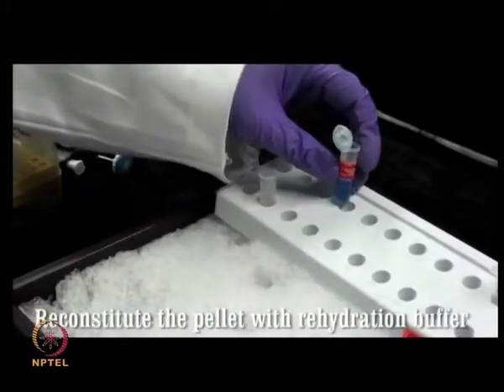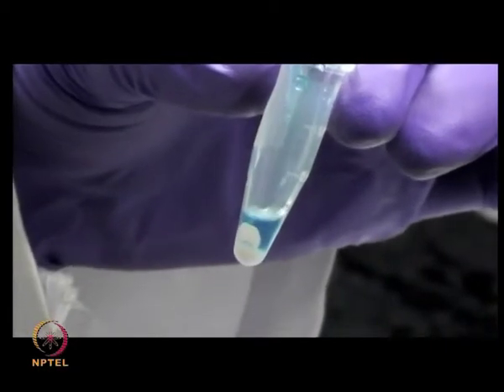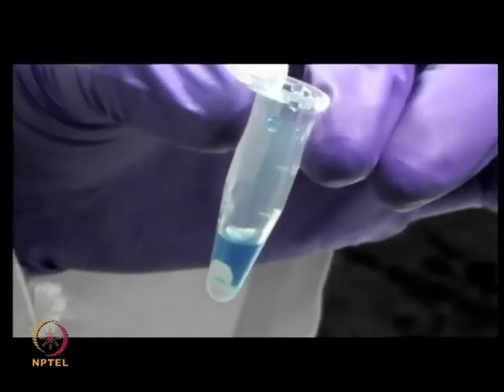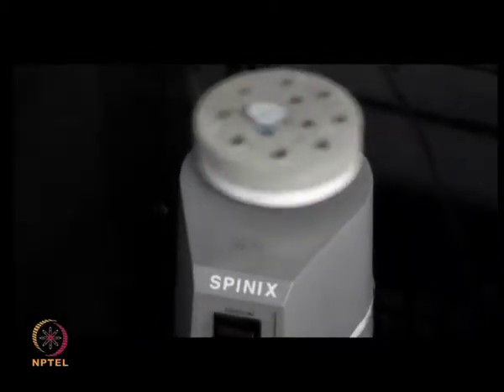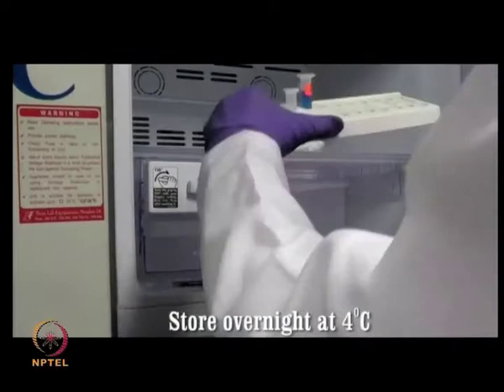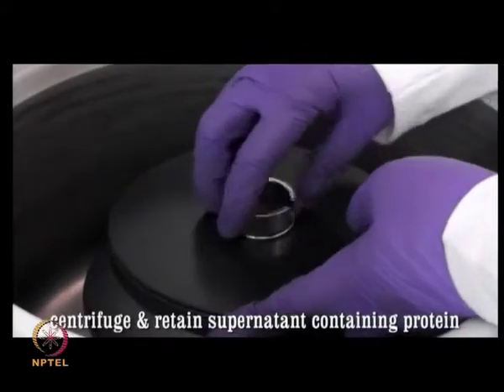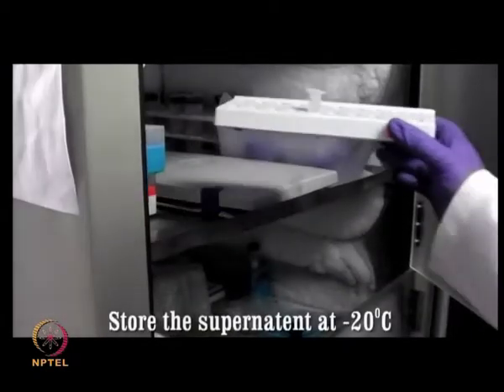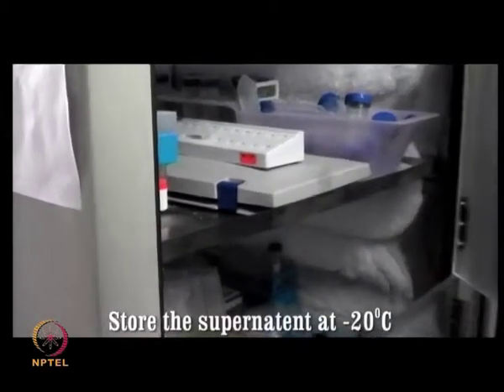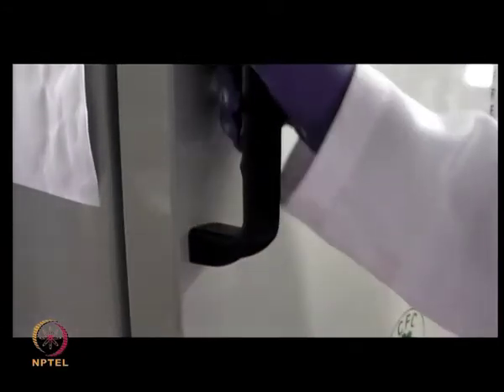Reconstitute this pellet with rehydration buffer. Vortex the sample to obtain a uniform solution. Centrifuge the contents the following morning at 10,000 rpm for 5 minutes. Collect the supernatant containing proteins in a fresh tube and store it at -20 degrees Celsius until protein quantification is performed.